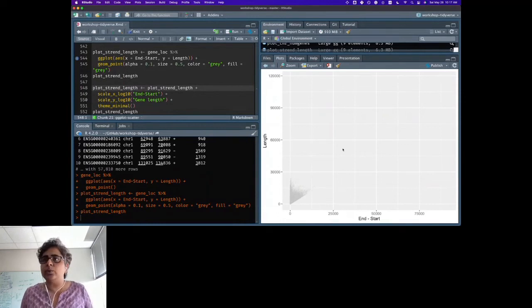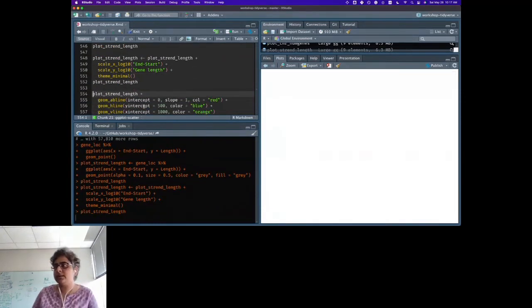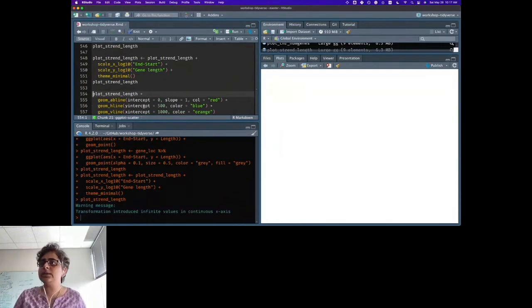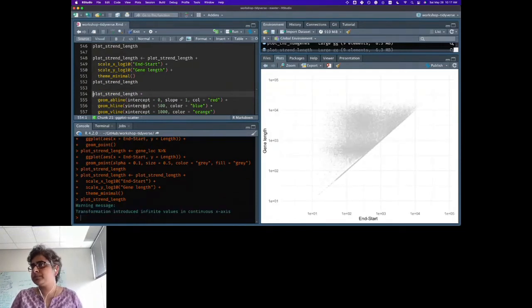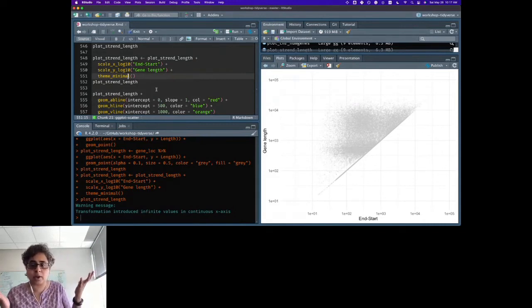Well, the gray is getting in the way again, isn't it? I'm going to remove the background again, so we just look at the points. And this time, I realize that everything is clustering there because I'm not using the correct scale. Once again, I'm using a log scale both for the X and the Y. And suddenly a pattern emerges. You can see the data, and it's already so much more helpful than the first plot.